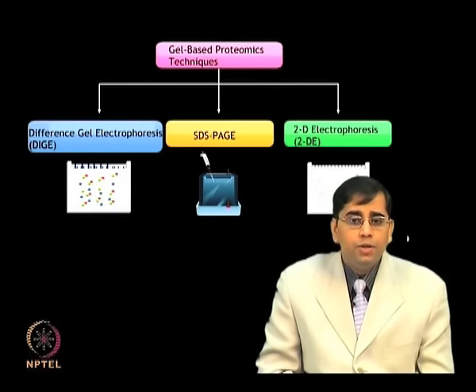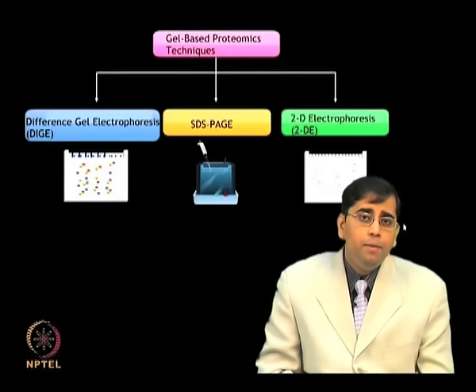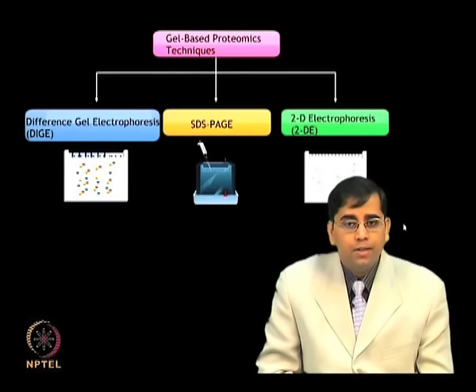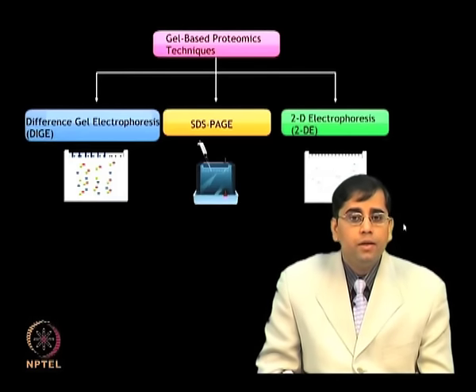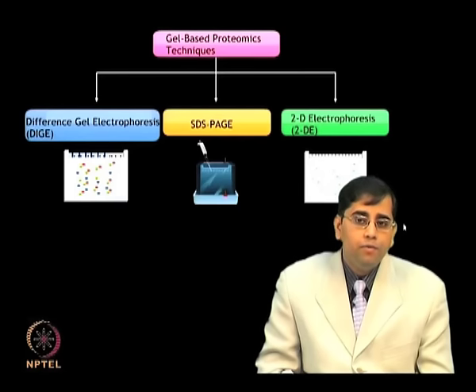Some of the limitations of two-dimensional electrophoresis can be overcome by the difference gel electrophoresis, or DIGE, technique. 2DE or DIGE in combination with mass spectrometry has been the standard technique for proteome analysis.